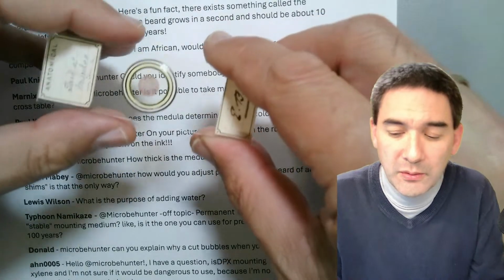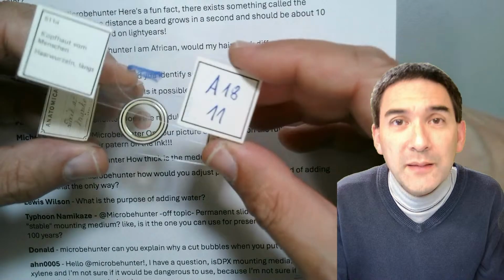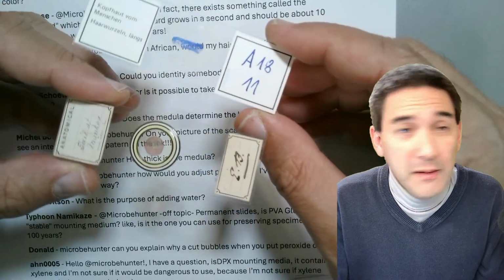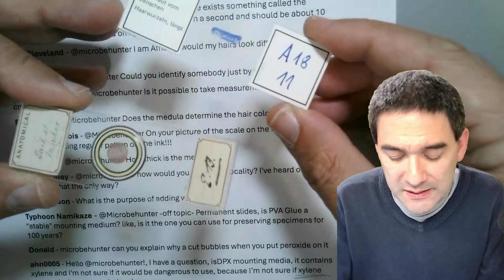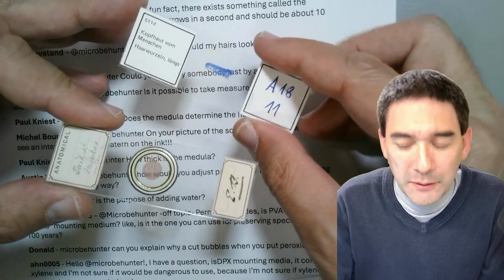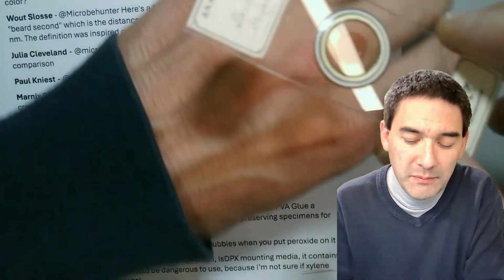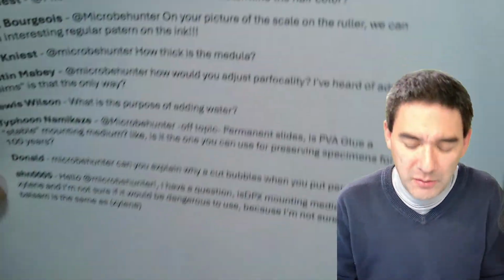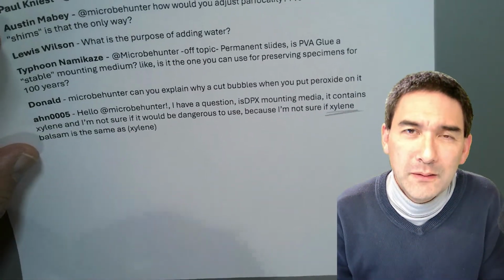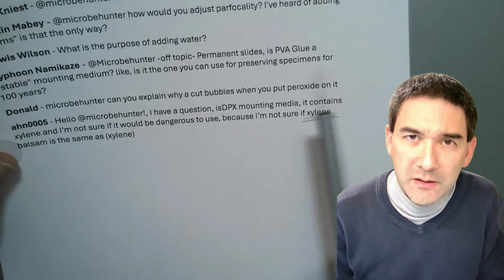Yeah, like the monkey tail or the human scalp, making these things is a lengthy process. Yeah, so I'll be honest with you, I've not been doing these things, because simply you need a properly equipped lab. You have to dehydrate the whole thing. You need to do paraffin embedding. Microtoming is not so much the issue, but you want to stain it properly. You have to dehydrate it and so on. It takes time and the lab, and then at the end you have to put everything into xylene. And so that's why there are these more modern mounting media and solvents that do not contain that.